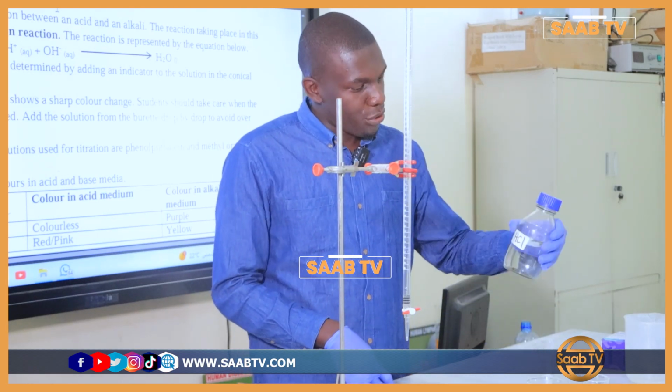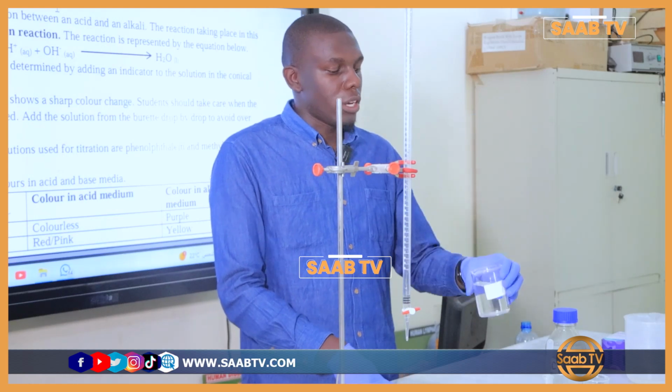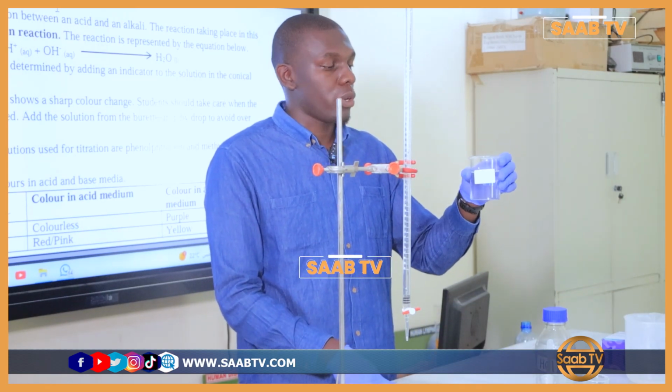Now the type of reaction which occurs in titration is known as neutralization because we're actually reacting an acid with a base. Is that clear? Just like the way we are going to do today, we are going to react our acid, which is hydrochloric acid, together with a base, which is sodium hydroxide. Now in this titration, our aim will be to find the concentration of the sodium hydroxide used in this reaction. The concentration of the acid is known and its volume. So we shall have to use a certain volume of sodium hydroxide, then we happen to get its concentration as well.